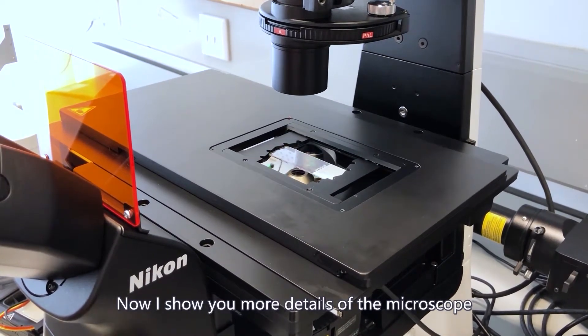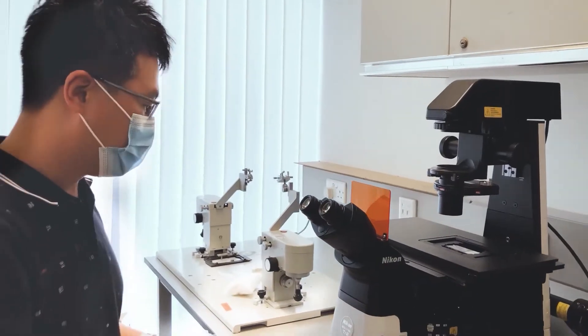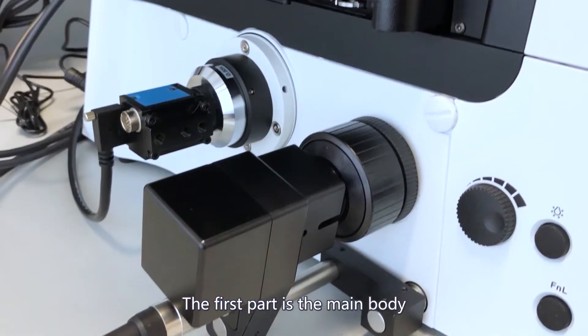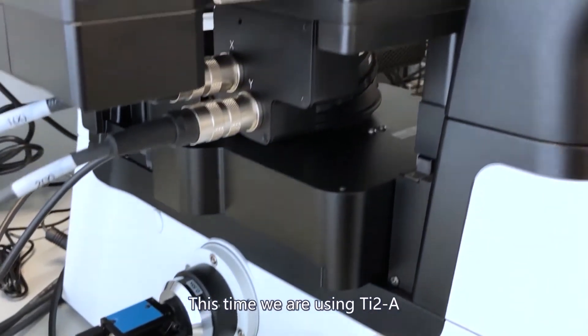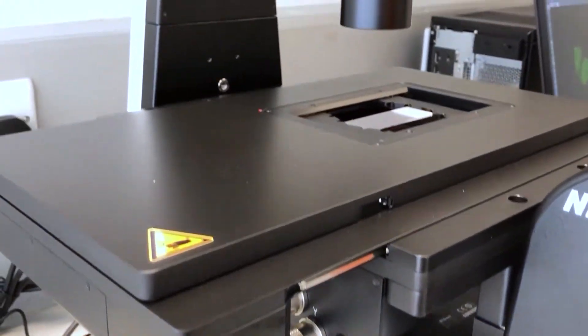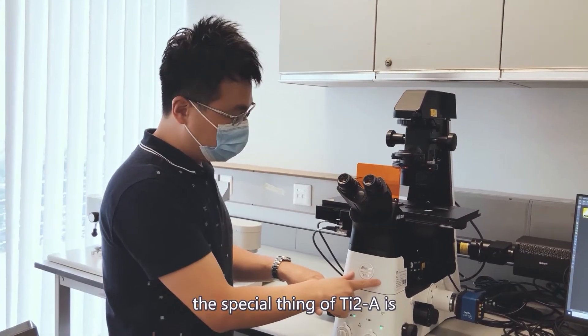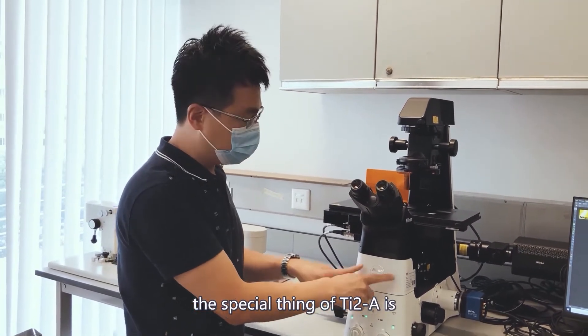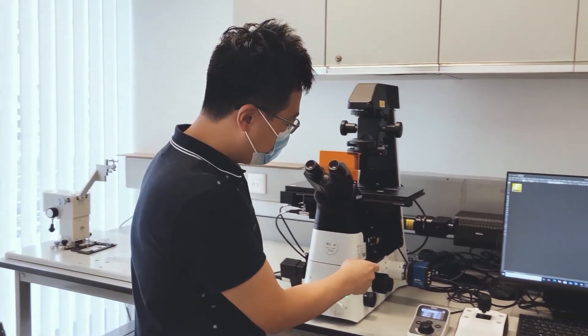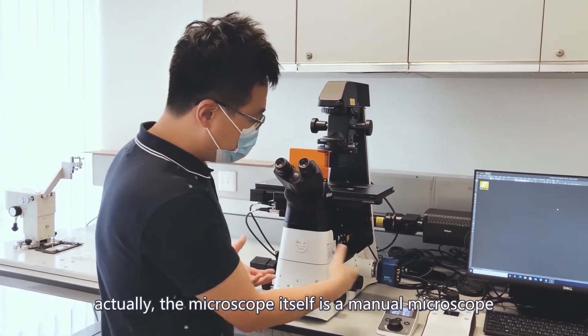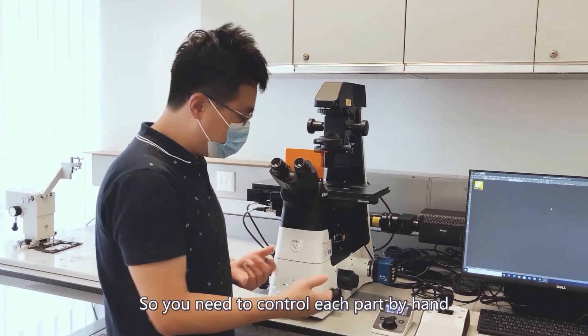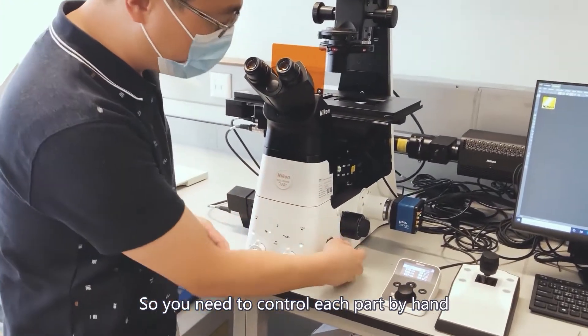So now I'll show you each part. The first part is the main body. This time we are using TI2-A, which is a middle class of TI2 microscope series from Nikon. The special thing of TI2-A is that actually the microscope itself is a manual microscope, so you need to control each part by hand.